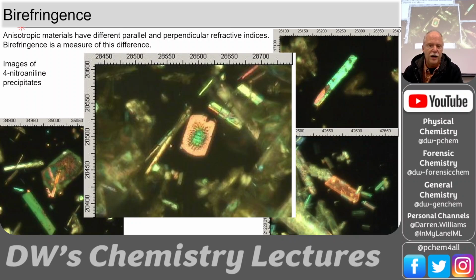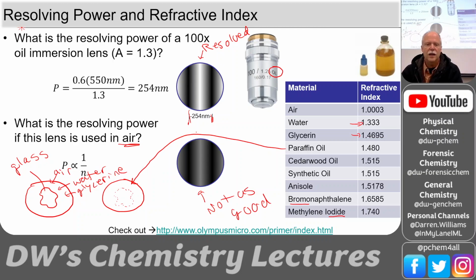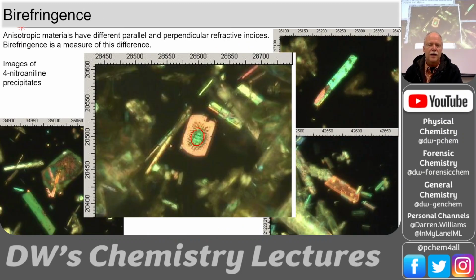But look right here, you've got this funny looking crystal, and you've got a green patch in the middle. This crystal was forming a nice flat crystal, but there was a pit in it where it still had some solvent. And then eventually the solvent evaporated away and left this little pit. It's kind of like a little swimming pool in that crystal. Whoa, that's tablet. Okay, so what we're seeing is different depths. This little pit is a dip in that crystal, and you can see it.